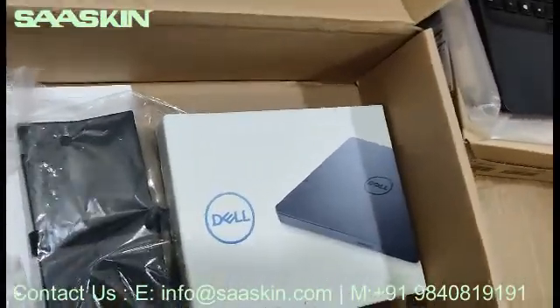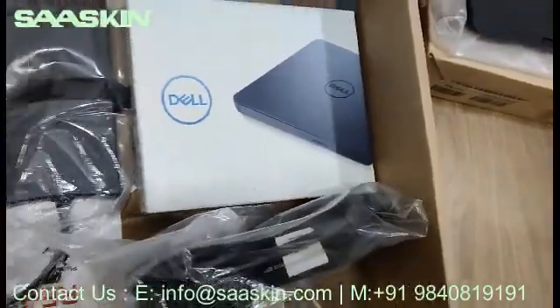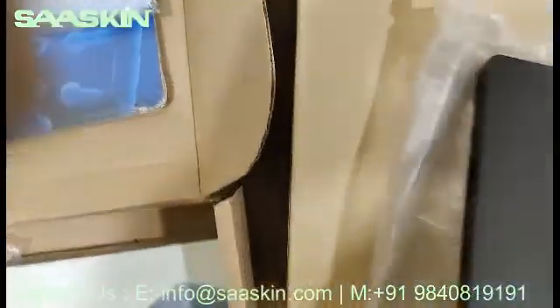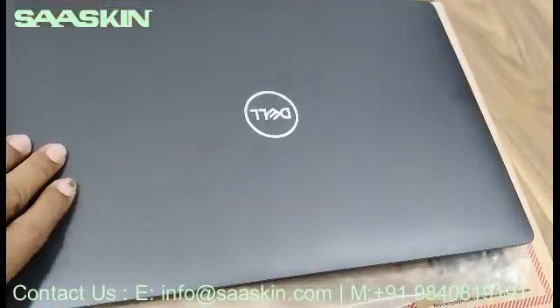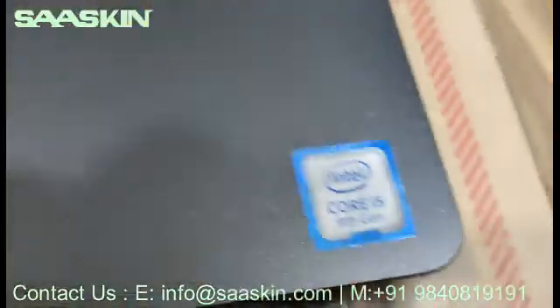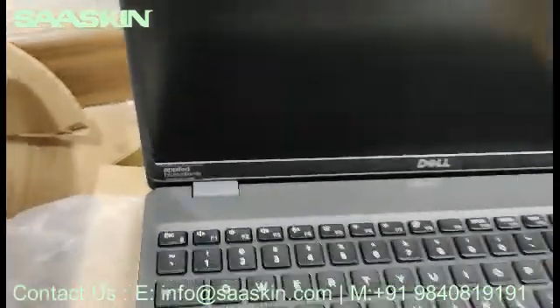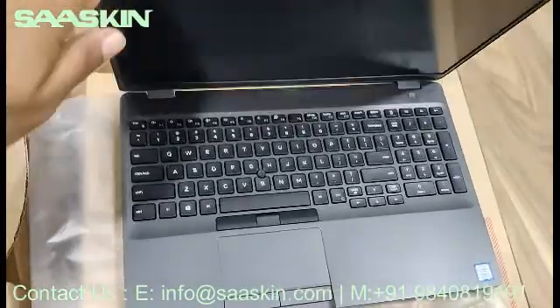And you have the power adapter, a power cable, and another power cord cable. This is the laptop model, so this all comes with it. We opened it for you — this is the laptop that comes along with the system. You can see it's configured for this QuantStudio generation model — it says Applied Biosystems, specifically configured for this instrument. These are the different accessories.